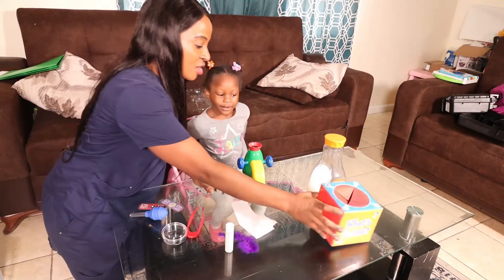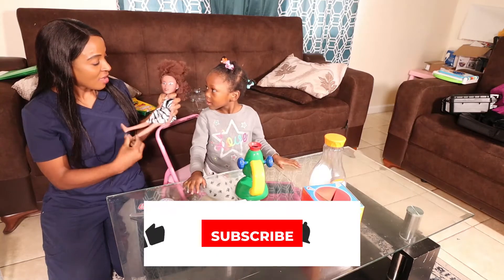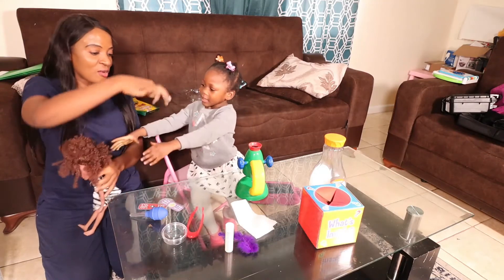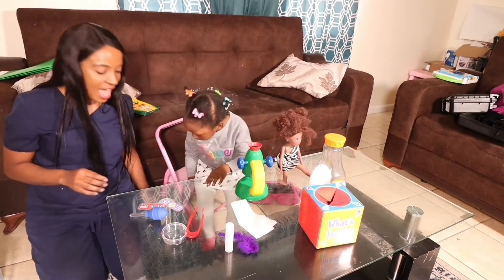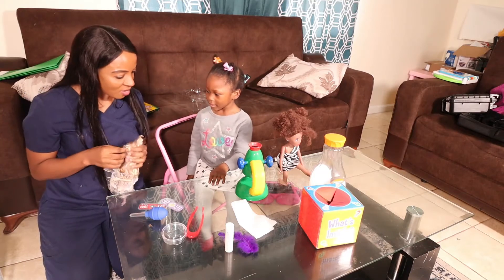Next we have the dolly hair — Amira wants to try the curly hair and the streak hair. First she starts with the curly hair from her dolly; she's going to pull it out and see what the hair looks like under the microscope. Now we're going to try the streak hair too because she wants to see that — she loves her dollies.